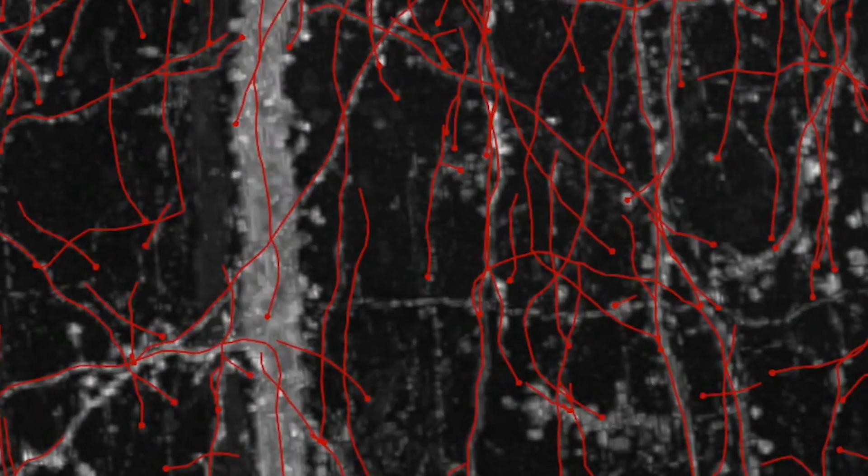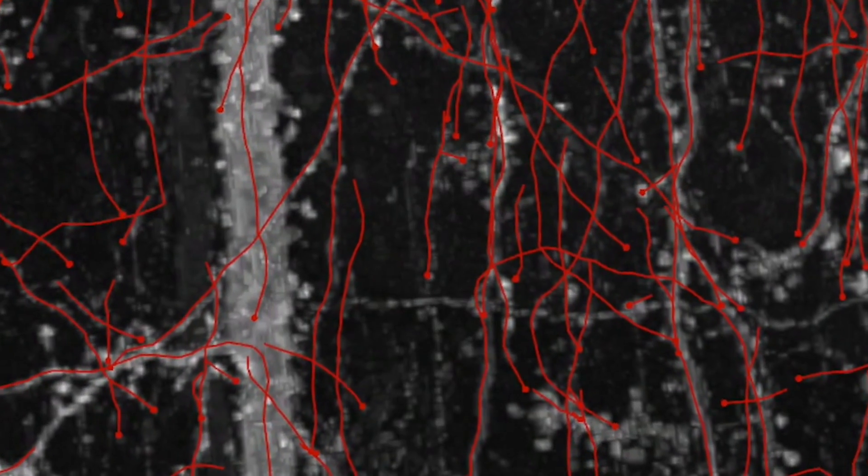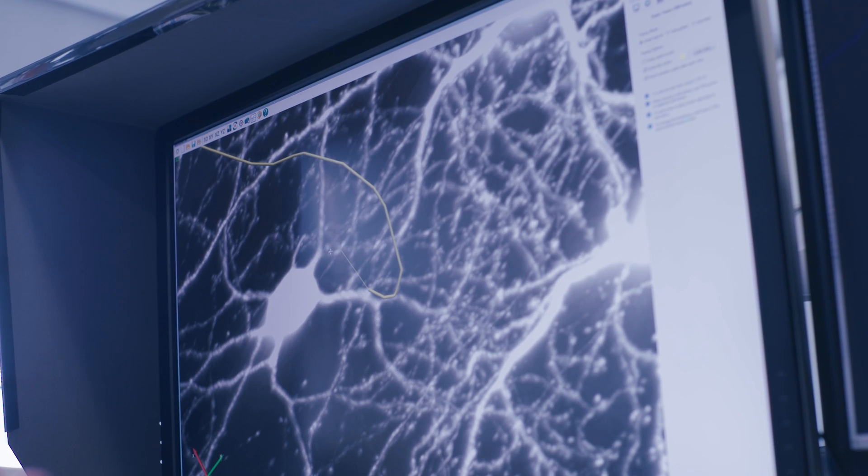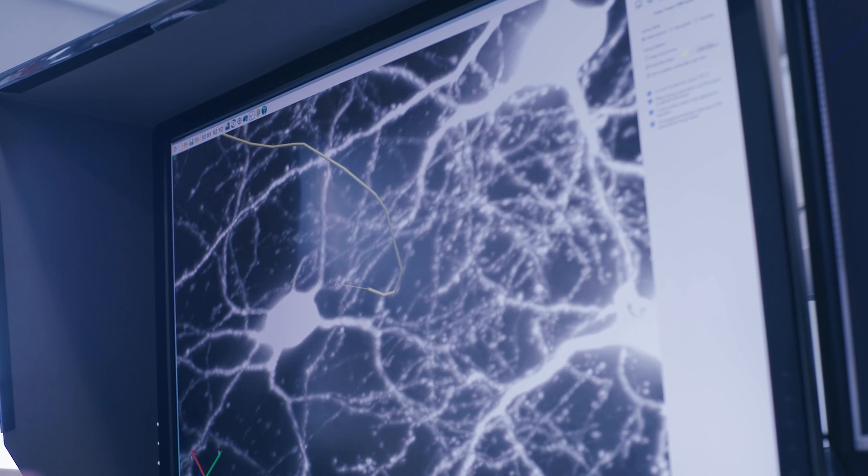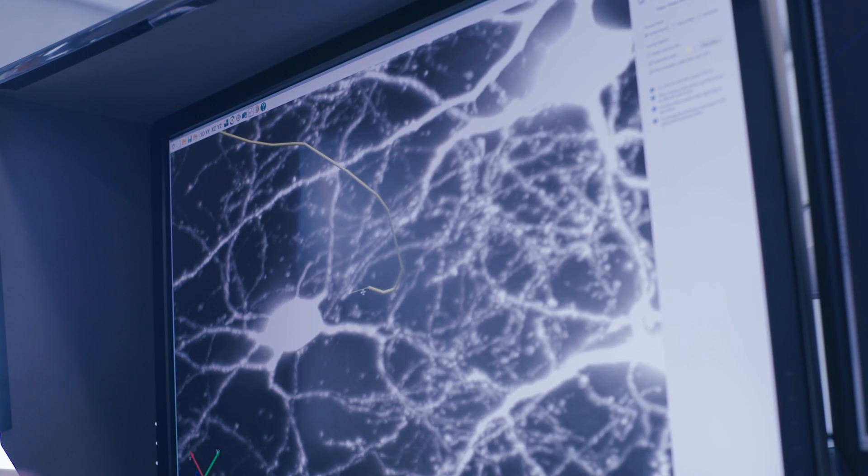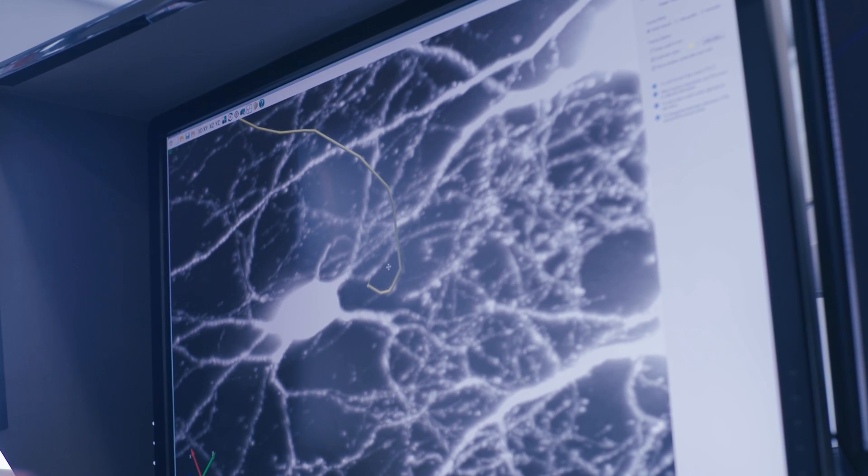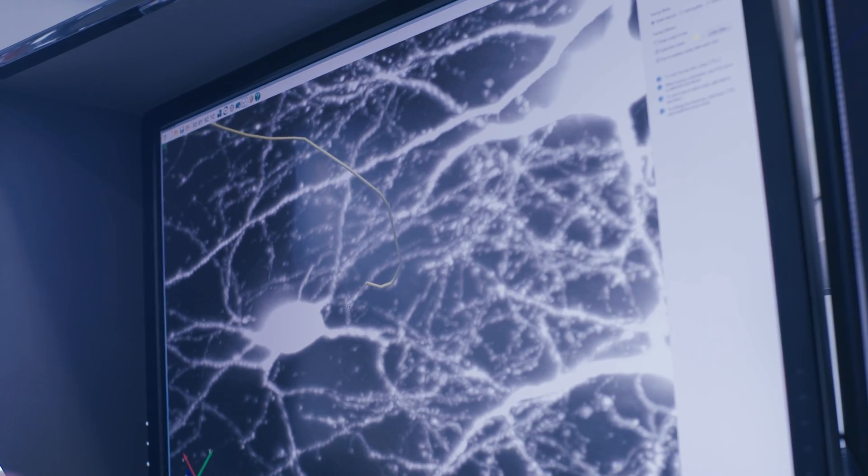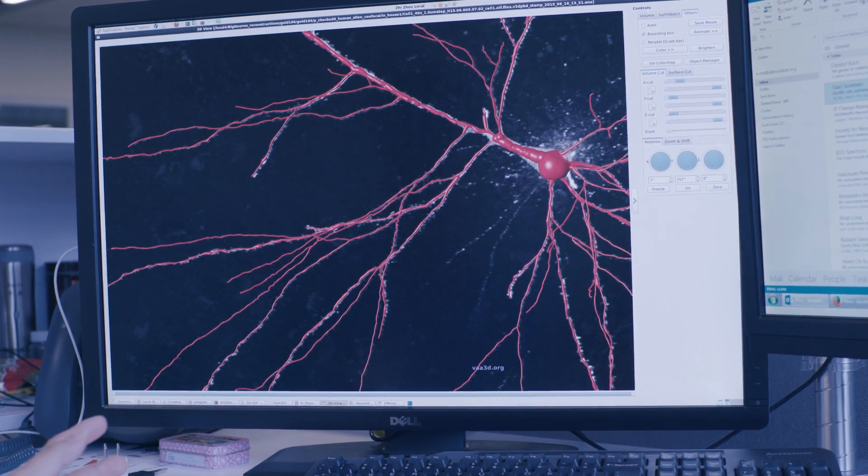What we do at the Allen Institute that's a little different than most people is we will actually take a three-dimensional image and then we'll do our reconstructions of the neurons based on those digital images.